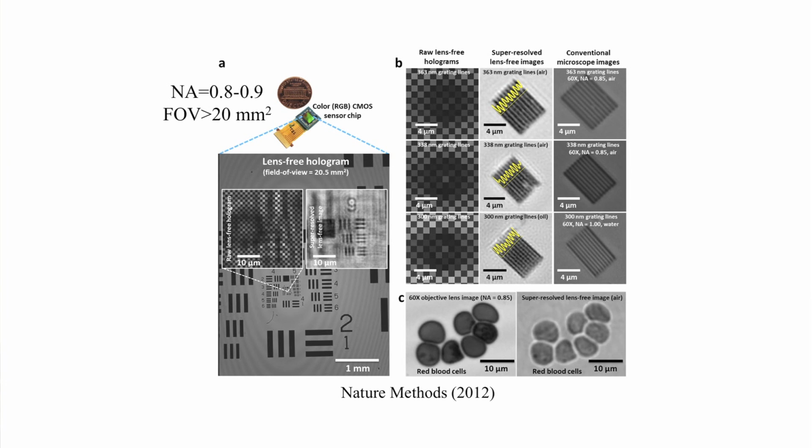Because we want to look at large areas. So if you're using a state-of-the-art CMOS, this one is a CMOS imager that you have in your recent generation Samsung Galaxy phones, very high-end CMOS manufactured by Sony. This is actually around 12 megapixels, and it has a 1.1 micron pixel size, but it can give you around 1 billion useful pixels with a resolution on the order of 250 nanometers, almost diffraction limited.